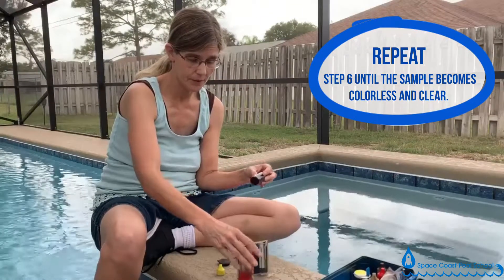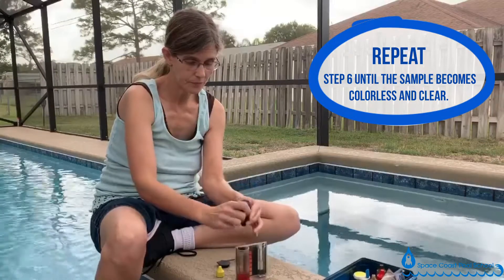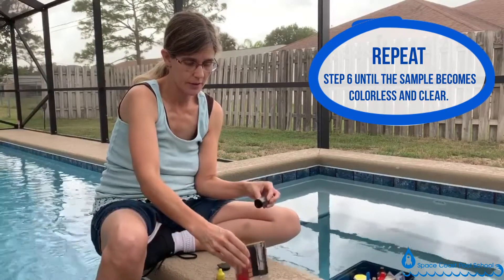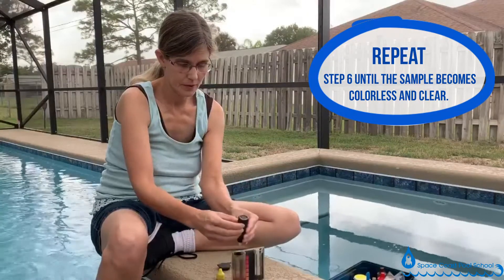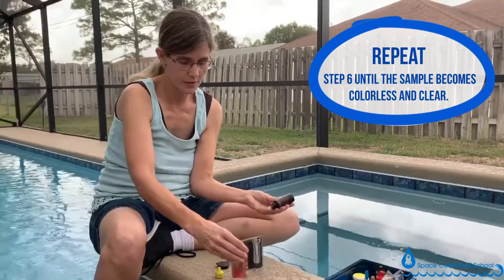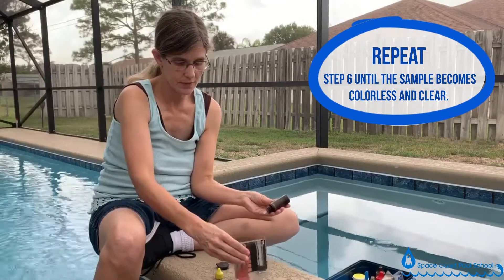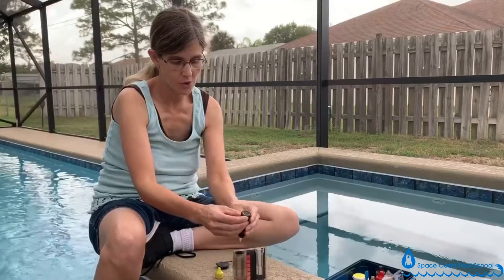Starting at three drops, I continue adding and counting — four, five, six, seven, eight, nine, ten, eleven, twelve, thirteen, fourteen, fifteen, sixteen, seventeen, eighteen — and we're almost there — twenty, twenty-one. Each drop is counted carefully as the solution gradually transitions toward colorless.